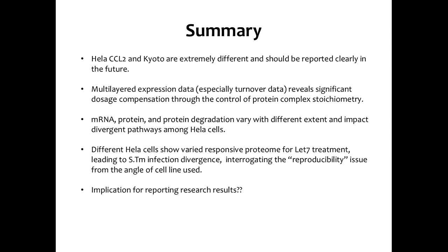Yansheng then also showed that these cells not only are different in the way they are genomically constituted, but also in how this genomic variability is translated into transcriptomes and proteomes, and he covered some rules. But he also showed that when you subject these cell lines to specific biological stimuli, they also react differently. So the summary of this experiment is that I posed the question: if 2 people do the same experiment with a cell line, can they expect reproducible research results? And the answer is no, because these cell lines are inherently quite different.